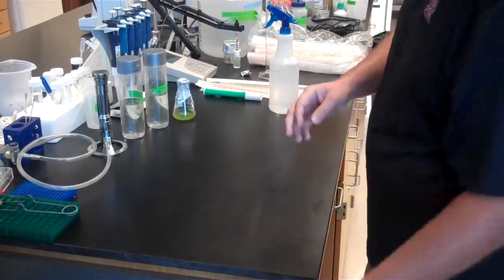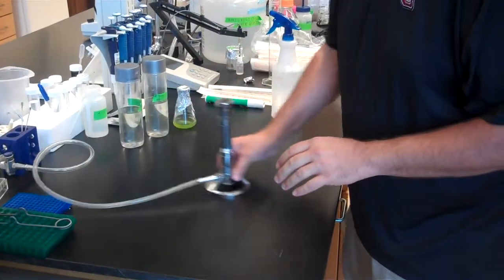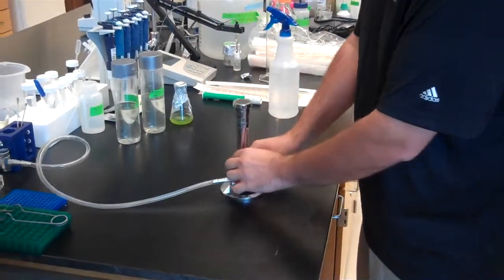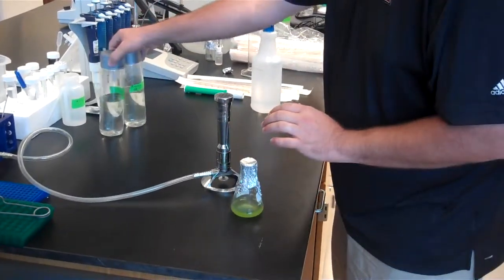The next thing I'm going to do is put everything into our sterile field, set it up the way that I want to set it up. Now, I'm a lefty, so if you're right-handed, you may want to do things a little bit on the other end from the way I'm doing it now.